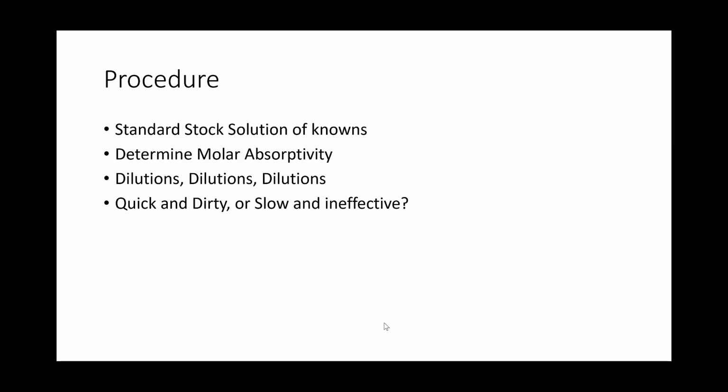How will you do that? You need to dilute your stock solution. So this experiment is largely about dilutions, dilutions, dilutions, and more dilutions. And I think everyone is short of time. In particular, we'll be short of time in this lab course. So we have to make every second count. How can we do that?